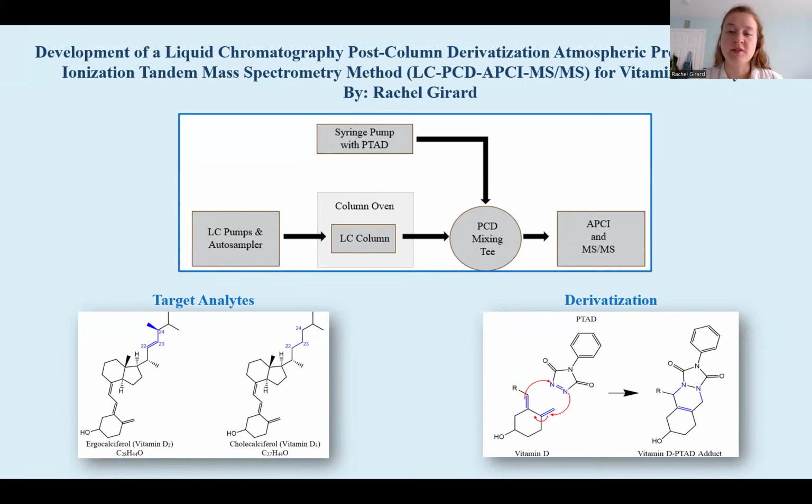My thesis focuses on method development, specifically the development of a liquid chromatography, post-column derivatization, atmospheric pressure chemical ionization, tandem mass spectrometry method for the vitamin D analysis. Now that is quite the mouthful, but first, why vitamin D? Now, vitamin D isn't exactly new.